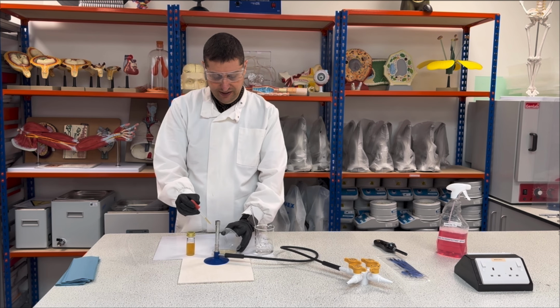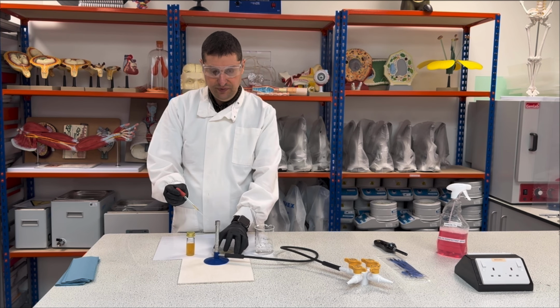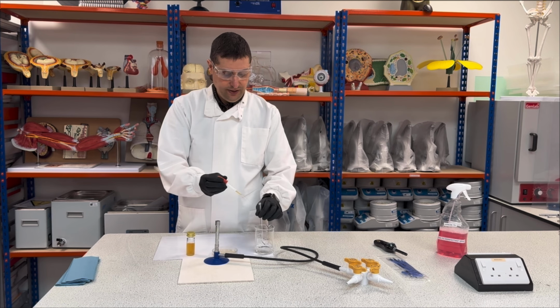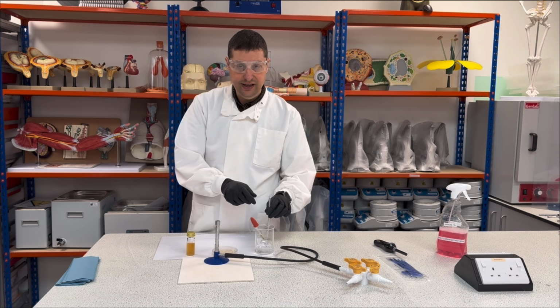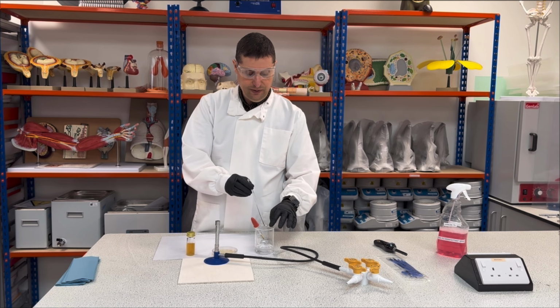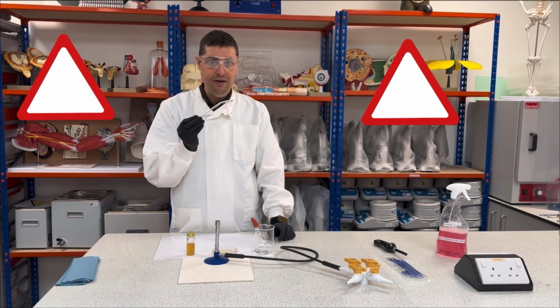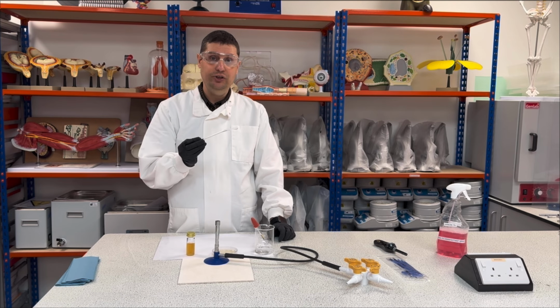So I'm gonna open this up, 1, 2 bottles, I will close and I will put here. I'm not gonna suck the water, the ethanol, okay? I'm just gonna keep it in there. Then I will take this off. Remember, this is ethanol. Ethanol is highly flammable, so you need to be very careful what you're doing.